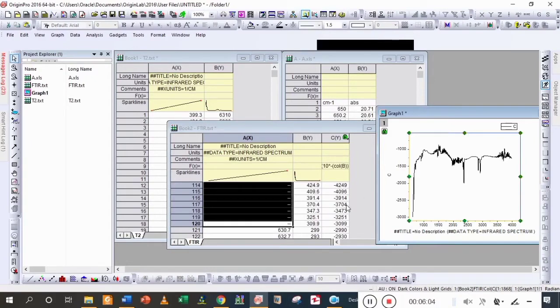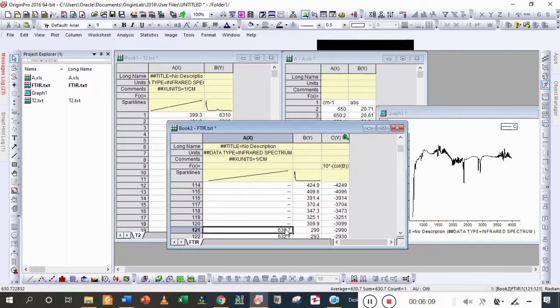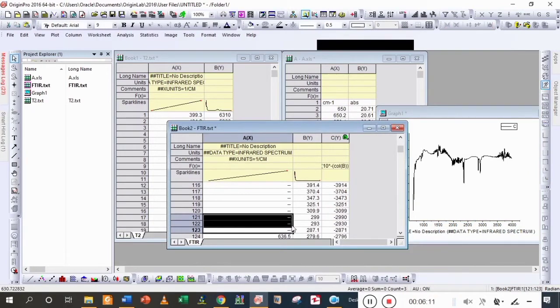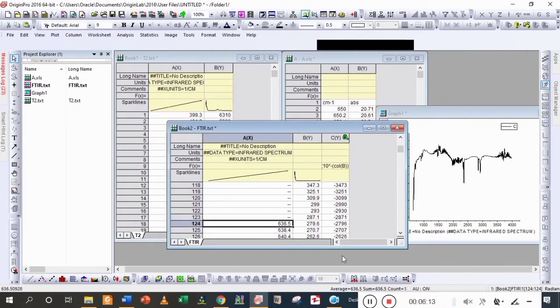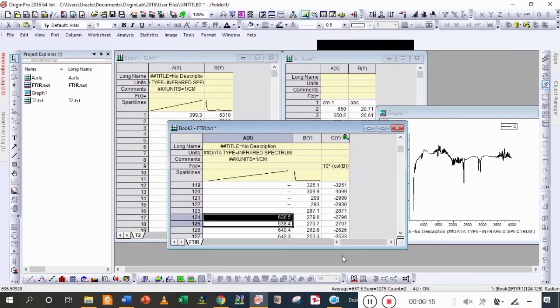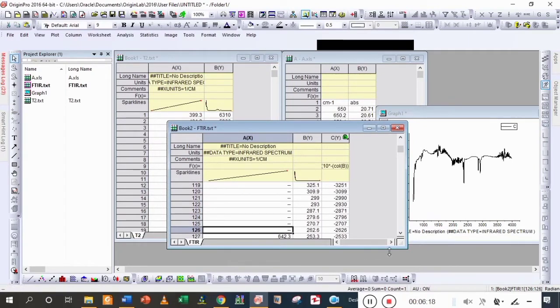I am going to delete some more values. As I press the delete button, you can see that the noisy data is going to be removed.